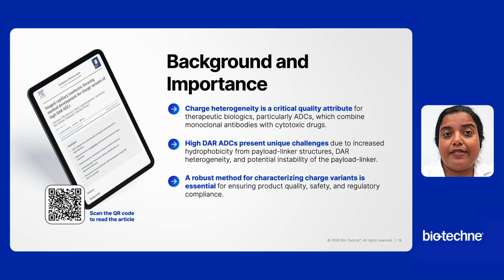The method optimization here focuses on improving the resolution and stability indicating capabilities and differentiating contributions from the protein and payload linker. For more details and further reading, please do scan the QR code to read this article. And I'll be sharing a couple of interesting data in a few slides from this article.